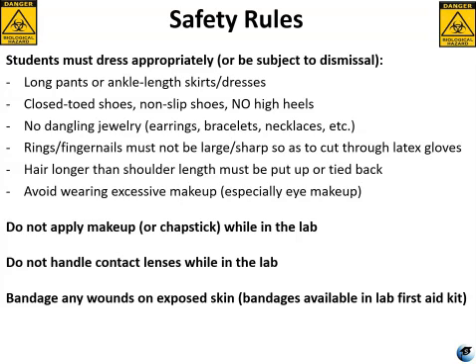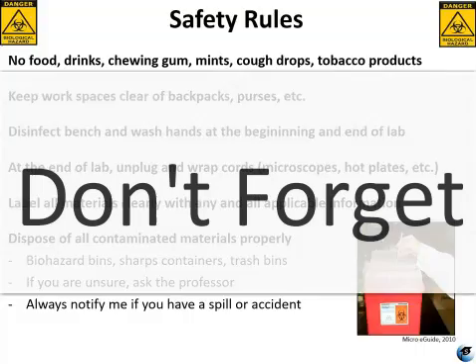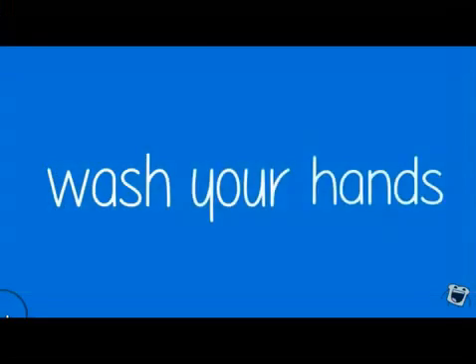If you have any cuts, especially on your hands, let me know before we start any experiments because I can get you a bandage to cover them up. Obviously, you're not bringing any food or drinks. You're not smoking in the lab. I'll show you where to put your book bags and purses and things. And I will also show you how to disinfect and the proper way to wash your hands. Wash your hands, don't forget to wash your hands.